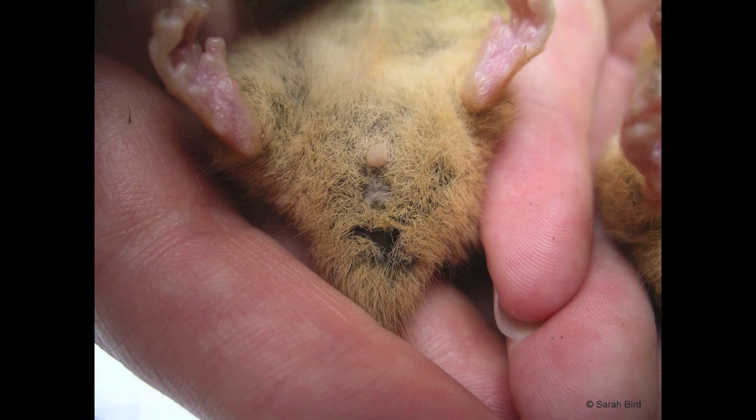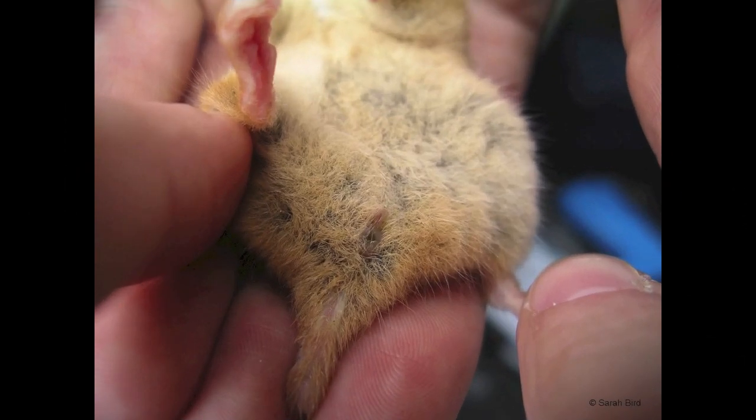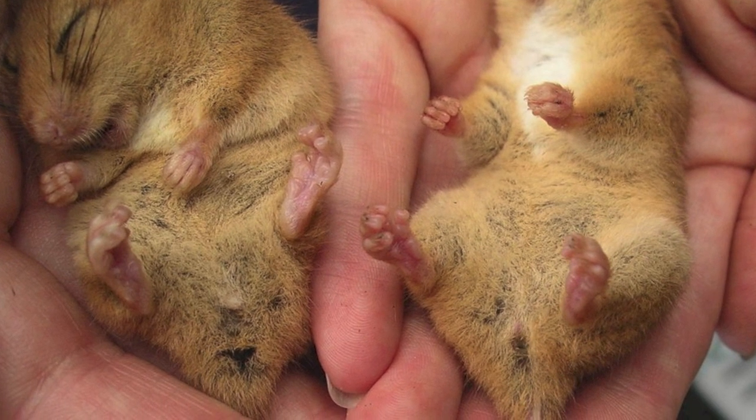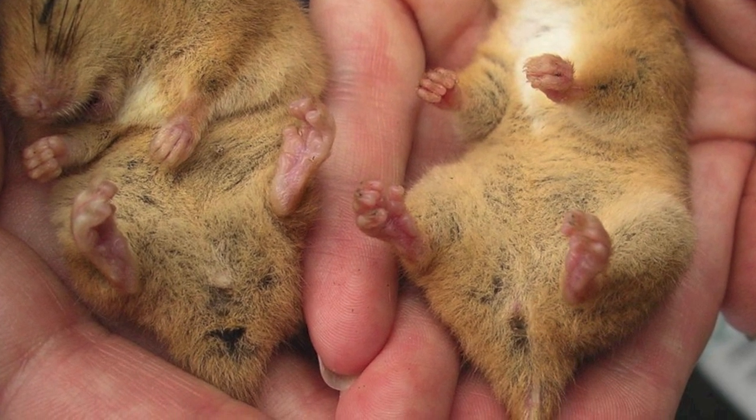Look at the distance between the anus and the urinary opening — a larger gap in this male than in this female. In these anaesthetised animals the sexes can be more easily compared. The male is on the left.